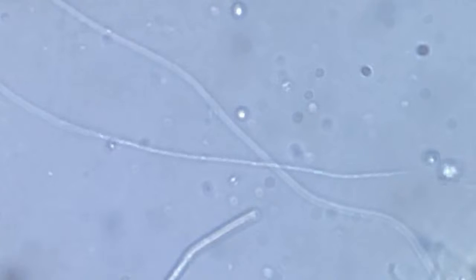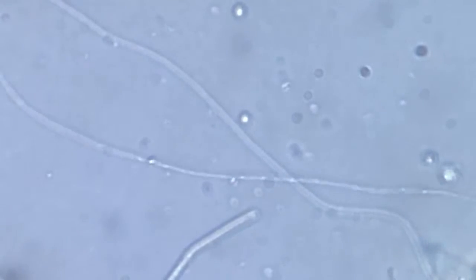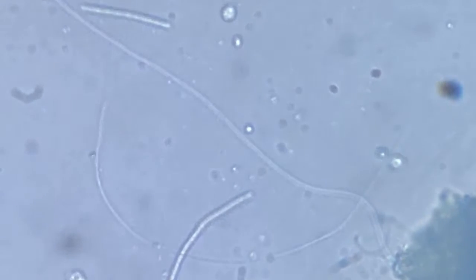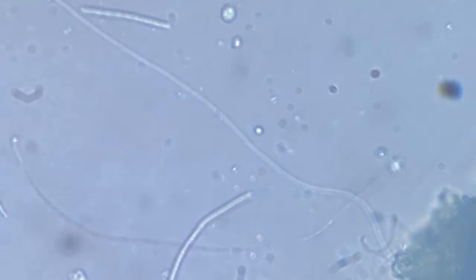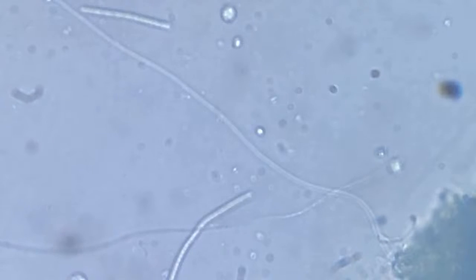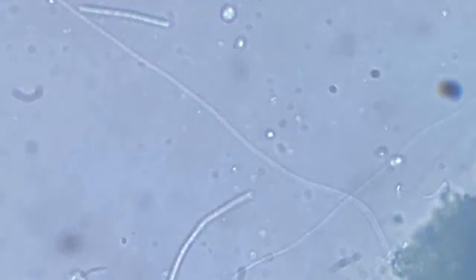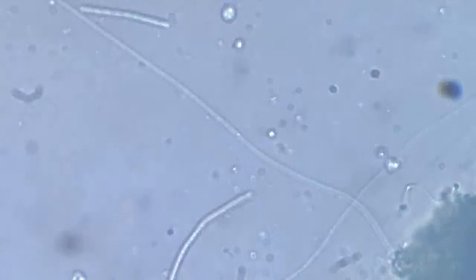At 800 times magnification, this is something weird to come across, something so extensively long. And going by the microscopic proportions, this is crazy, to say the least.